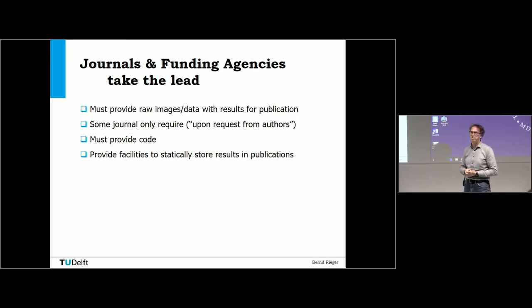Some journals now have reporting summaries where you say, okay, I have investigated 100 cells and I found this in 5, and you must disclose this. They explicitly ask you all these questions, and if you sign it, and then it really is a fraud. Before, you could get away just by not telling.